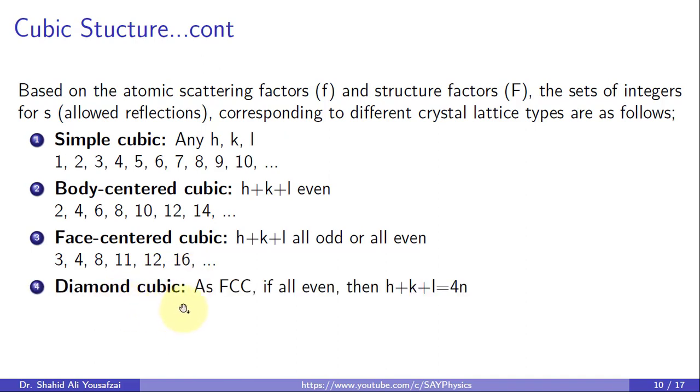The diamond cubic is an extension of the FCC, which has possible reflections when all the indices are even. In addition, h + k + l is a multiple of 4, i.e., 3, 8, 11, 16, and so on.